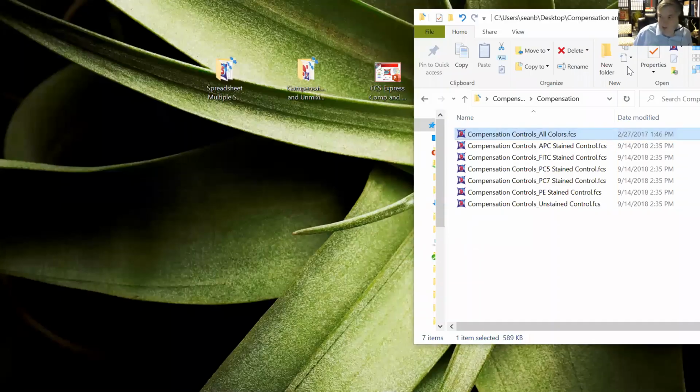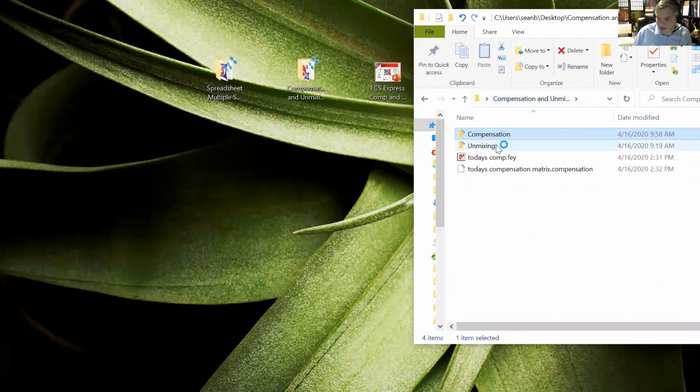So let me open up FCS Express again. I'm going to come over here to where our data files are. And let me get FCS Express launched up. So I had closed out of it completely there by accident, but it's launching up on my other screen. So just bear with me here for 30 seconds while it launches up.